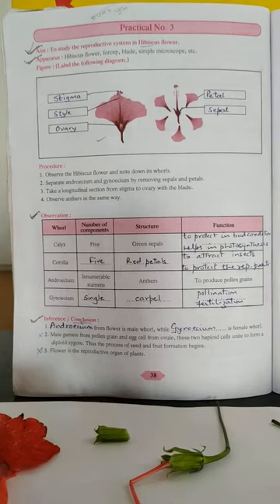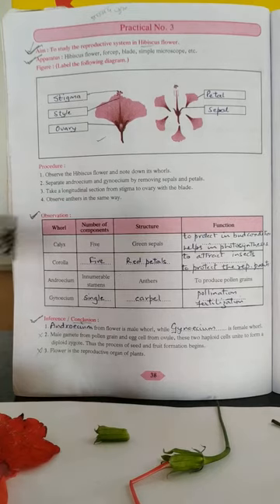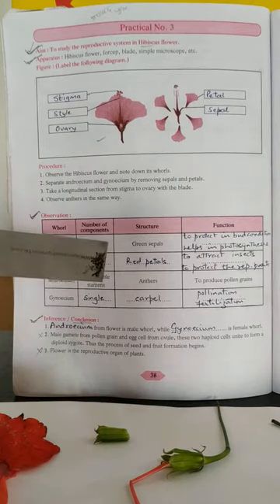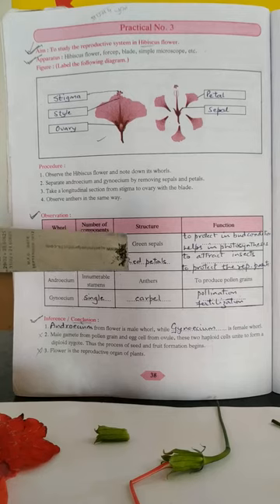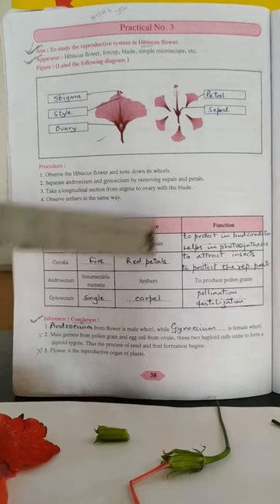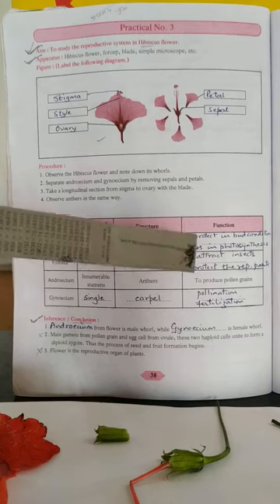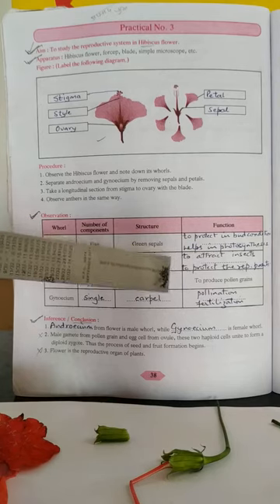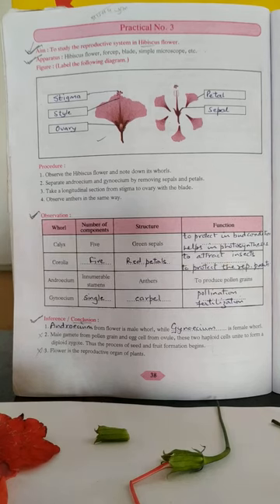Now in the observation table, as you can see, the whorls are given, number of components are given, structure and function. Some of these are given and some we have to write on our own. So the first one, calyx, number of components 5. The structure is green sepals, and the function we have to write is to protect in bud condition, that is the first function, and the second function is helps in photosynthesis as it is green in color.